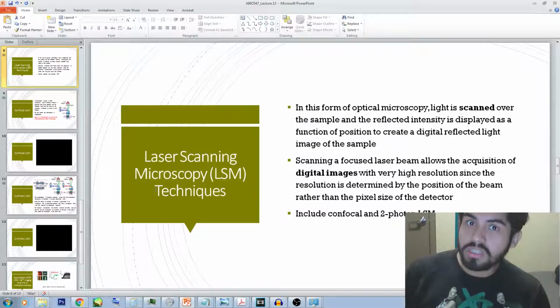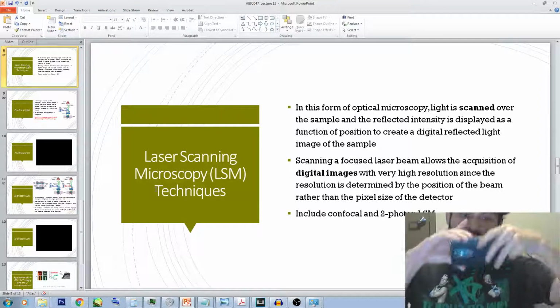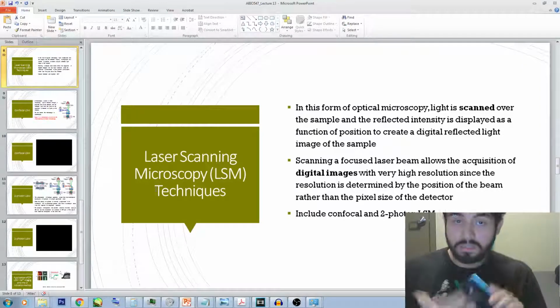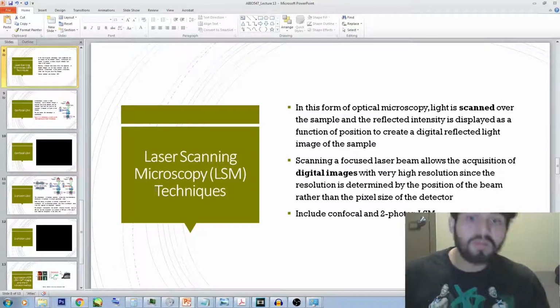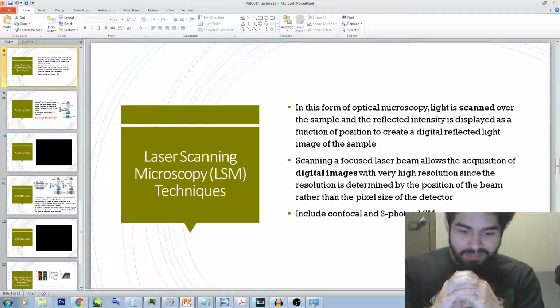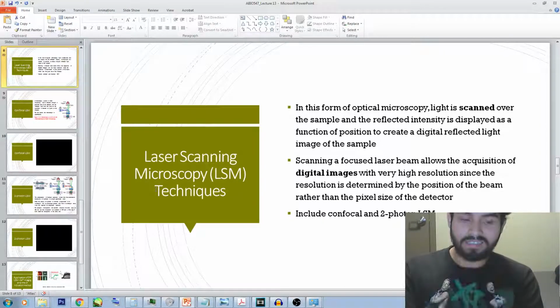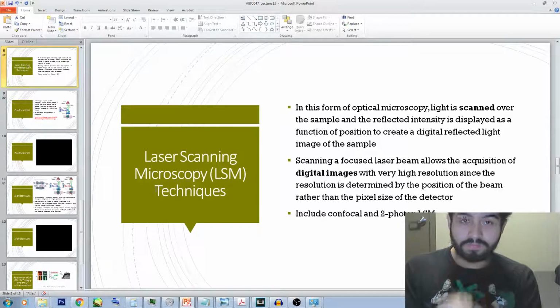That's what digital imaging means. If you take a camera, like a phone or something, you take a picture, this one is around 16 megapixels, which means there's 16 million pixels making up an image. Alright? So one shot of that laser is 1 pixel. It's going to be one color from that, not the image, but the specimen. Enough of those little points, enough of those pixels will make an image that you could see digitally.